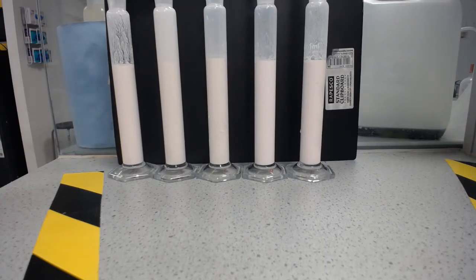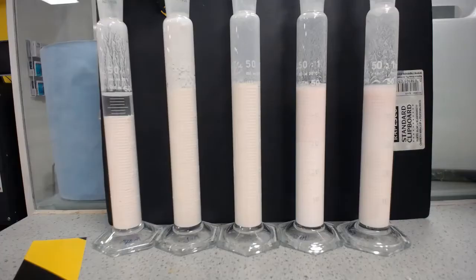So you can see at the beginning, we've got 5 formulations there all ready to sit and see if they're going to separate or not. And they will look pretty similar at the beginning, and we'll see how they look in an hour. So we're back after an hour, and the 5 formulations have been sitting here, and some of them have been slowly sedimenting and others haven't. I think what's clear is that all of these are better than most of the bismuth suspensions, but we do have a lot of other stuff in here, and they're different ingredients.